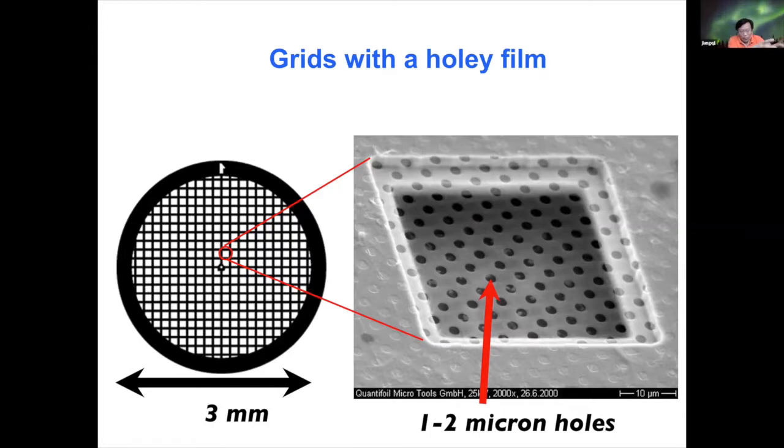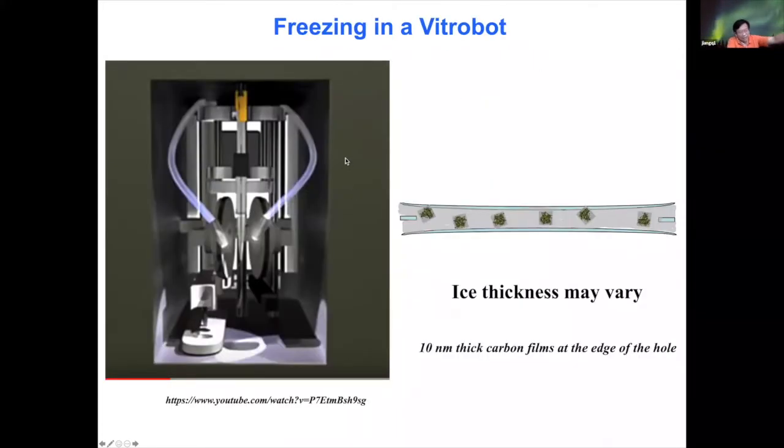And our molecules are in the range of about 20 angstroms to hundreds of angstroms in diameter, much smaller than the holes. The idea, to make a sample, is to load the sample in suspension onto the grid, and then load the grids into a device, a modernized version of the device first implemented by Jacques Dubochet, which is used for flash freezing.